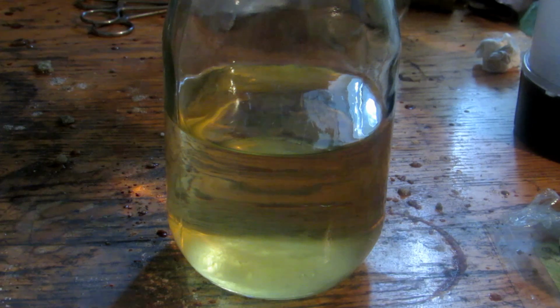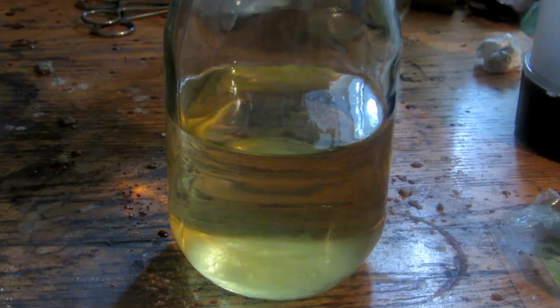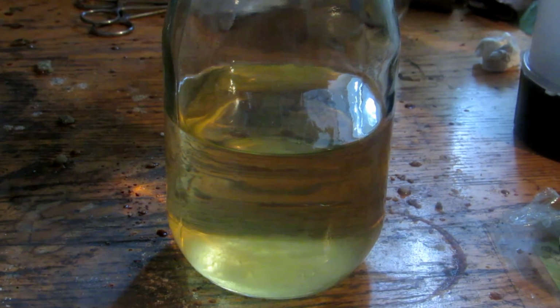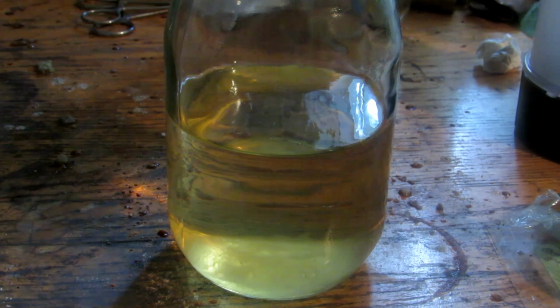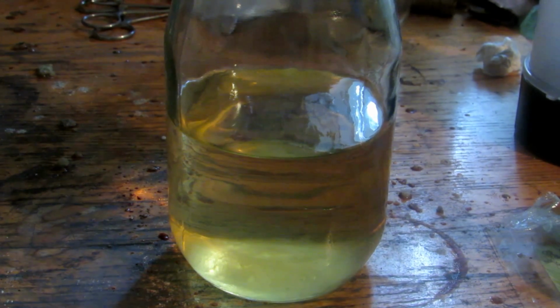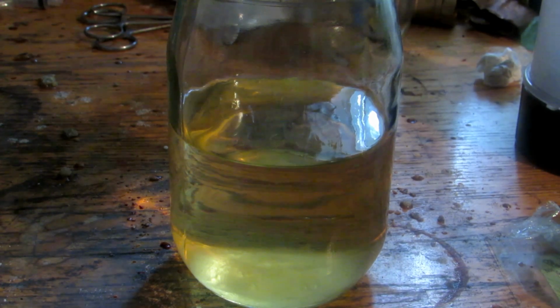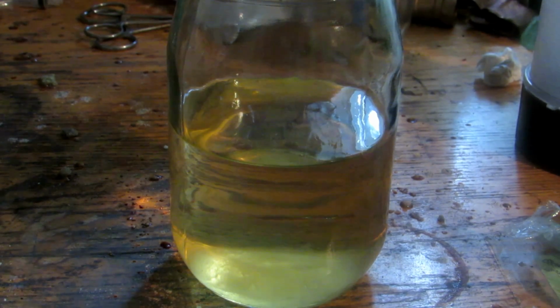So alternatively, I'm just going to top this up to probably about here with some hydrochloric acid. I think I'll try that first and perhaps go to other acids if it doesn't work. So I'll top it up to here with hydrochloric acid, and we will be forming sodium chloride in solution and silicic acid, which may stay in solution or may precipitate out. I'm not totally sure. So we'll go outside and start adding the hydrochloric acid. It's just going to be 30-something percent that we bought at Home Depot. It's called muriatic acid. I'll show you in a moment.